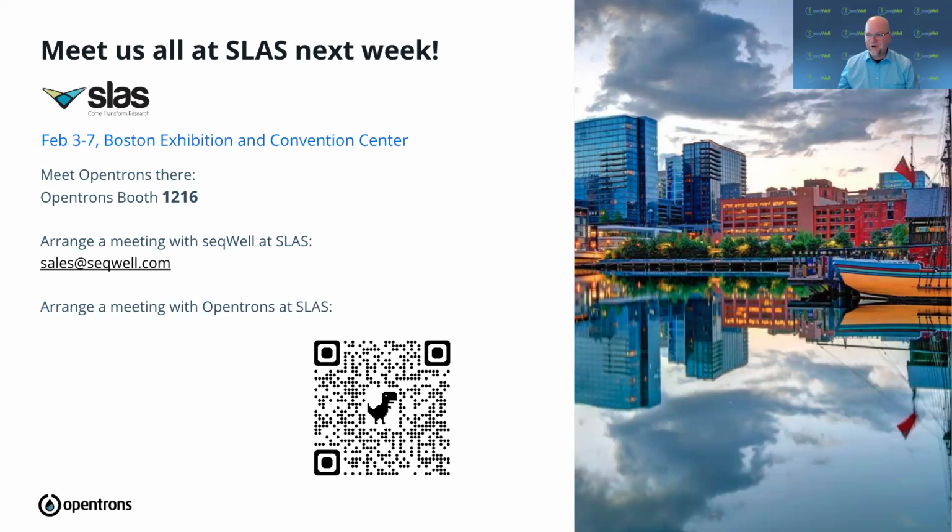Next question from Jessica. What is included in the preloaded reaction plate? How many barcodes are available for the current 96 plates? And then there's a follow-up question for you, Kinnary. In the preloaded reaction mix, that is basically a master mix that allows for all of the amplification piece of it.